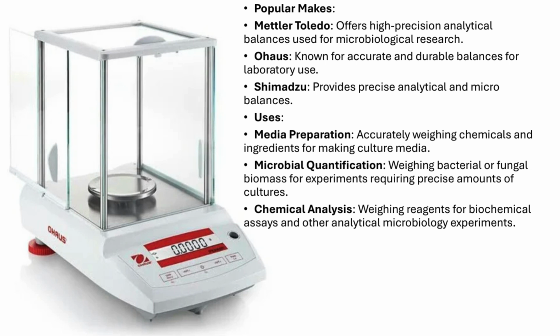Uses of analytical balances in microbiology. An analytical balance is crucial for several key applications in microbiology. Media preparation. When preparing culture media, accurate measurement of chemicals and ingredients is essential. An analytical balance ensures you add the right amount of each component, maintaining consistency in your experiments.